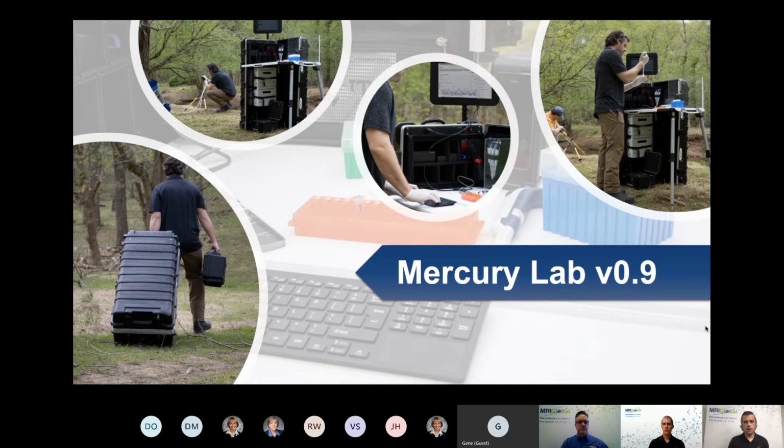So you can see here in the top left, there are 2 separate Credo cubes. Those are cold chain storage. They're not powered. They work off of phase change cooling material, so they can keep temperature for up to 96 hours. The top one was a 4 degree, and the bottom one was a -20 degree cooler. Below that, you'll see our lithium-ion battery brick that we were using for this version.